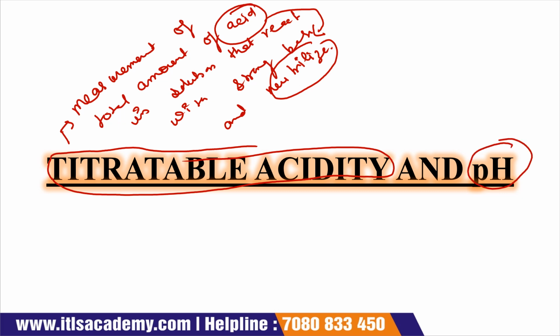And pH, we all know that pH is simply the acidic or basic nature of a food product.